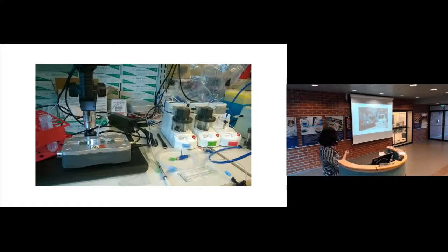This is just a high-speed microscope with which we can monitor the chip. So 3 tubings are going into the chip, then the droplets are formed, and then the 4th channel is collecting the emulsion into the Falcon tube.